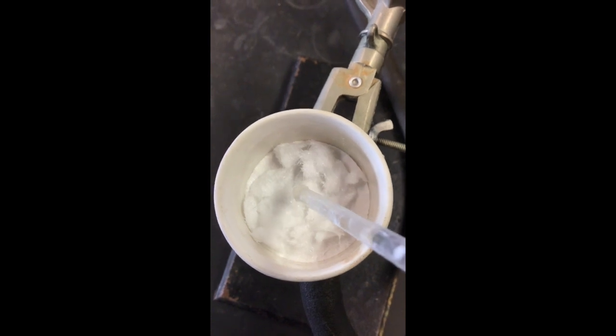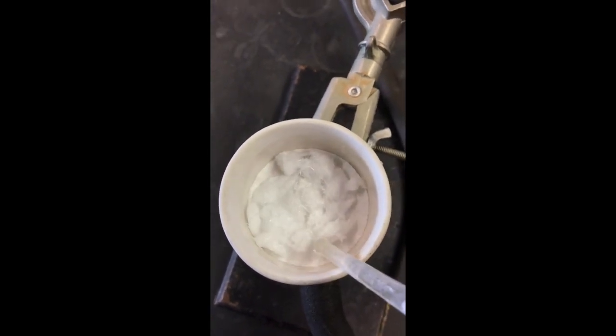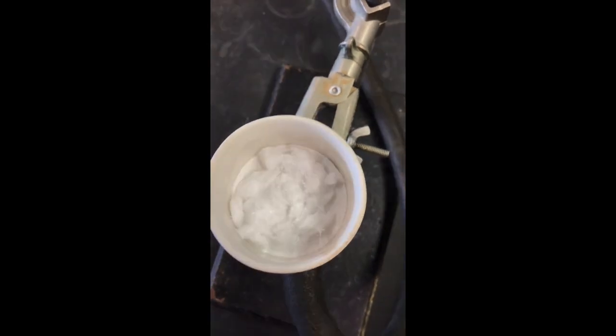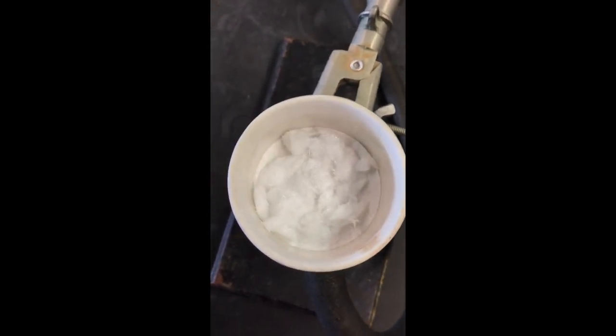And so that's going to be done by spreading it out so that it comes in contact with the filtration or the filter paper. That way the vacuum's actually having an effect on it. And so that's pretty much it for the filter or the recrystallization process.